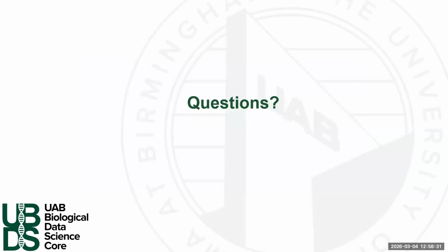Great talk. It added to my theories. I have just one question about when the data is generated from different platforms: is the community making any effort? If we do secondary analysis, some clustering between different data sets from different resources generated at different places, how are we going to deal with this? This is for Oxford Nanopore. What if I'm interested in multiple platform generated data and want to put them together in some sort of clustering? Yeah, so you're talking about, what if you're going to do Oxford Nanopore and PacBio?